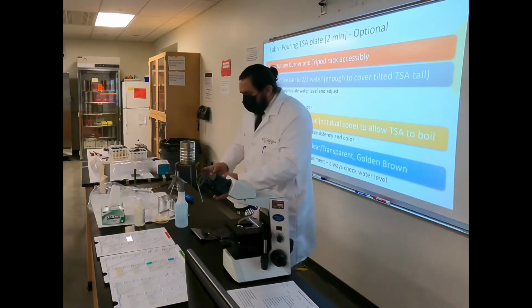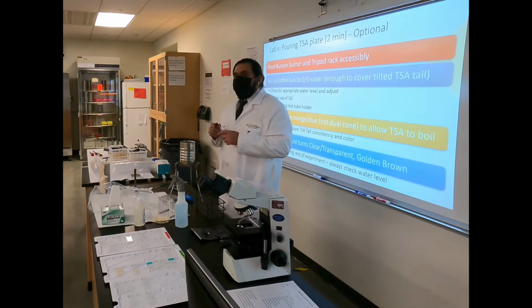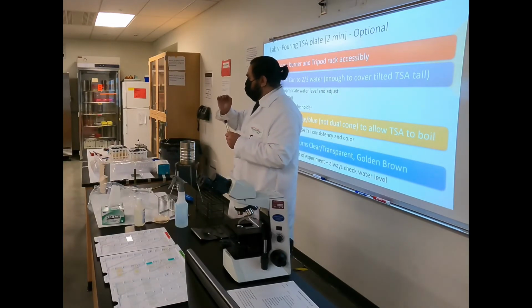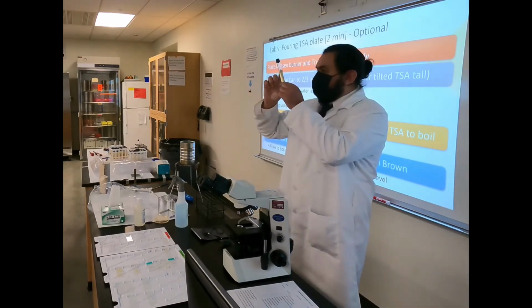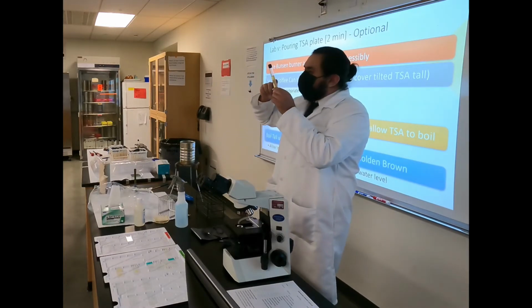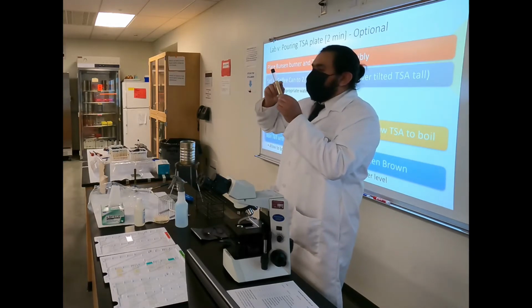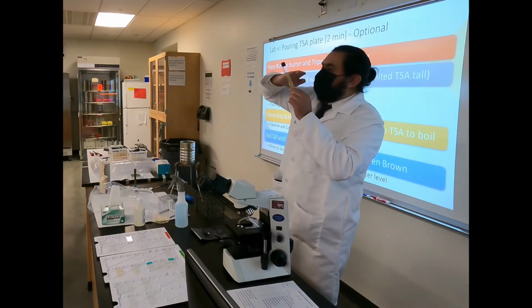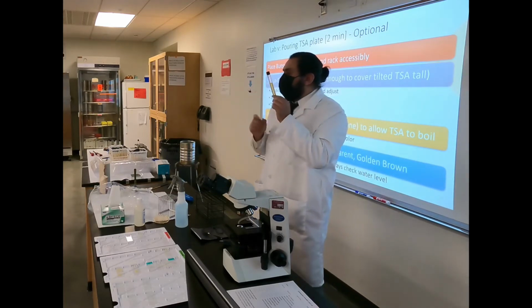So take it back to your bench, and then you're going to place it inside your can, and that's when you want to measure the water. Because you want to make sure that the water covers the medium. This is one of the most common concerns: if the water goes below the medium, the whole thing will not melt correctly. So you want to make sure that the water is right above the level of the medium. Not the tube, but the medium itself, the little off-yellow portion.